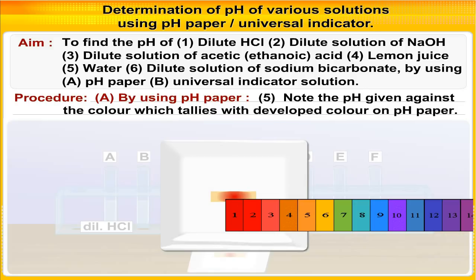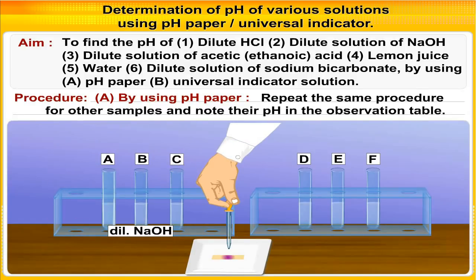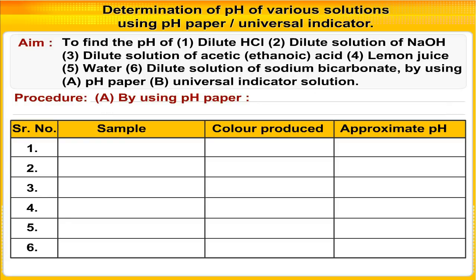Observe the color developed on the pH paper and compare it with the colors in the chart on the cover of the pH paper booklet. Note the pH given against the color which tallies with the developed color on the pH paper. Now repeat the same procedure for other samples and note their pH in the observation table.